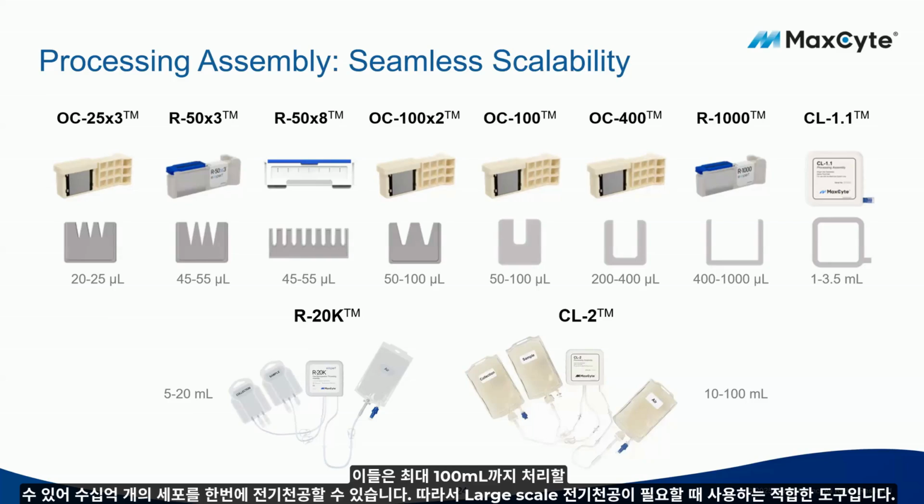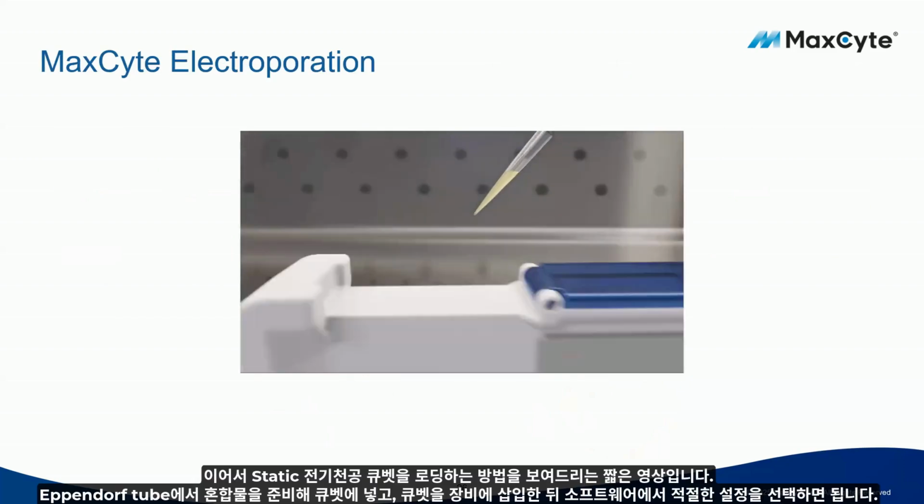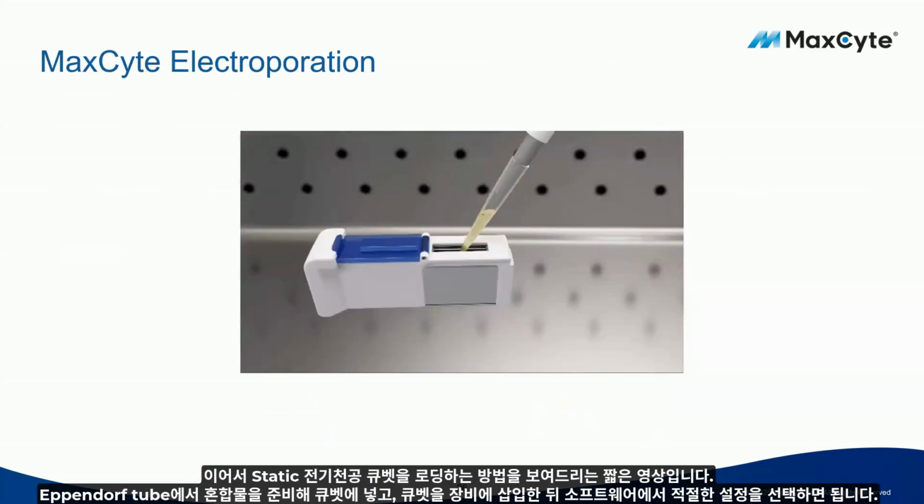These can handle up to 100 mL of electroporation volume, which is billions of cells. So if you ever need something that large, for example, for a large batch of cell electroporation, this is the correct tool to use.